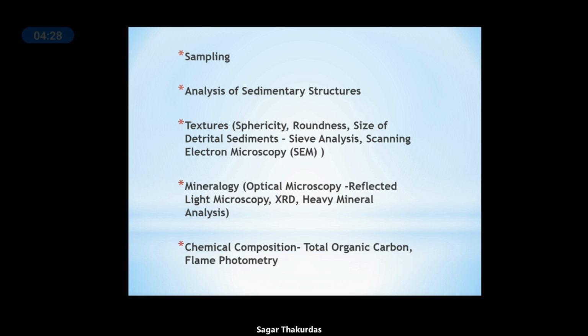And apart from that, there is flame photometry. As I told you, for each of these parameters to be identified, there are various techniques that we can use, but the data is vast, so I have limited the tests that we can perform.